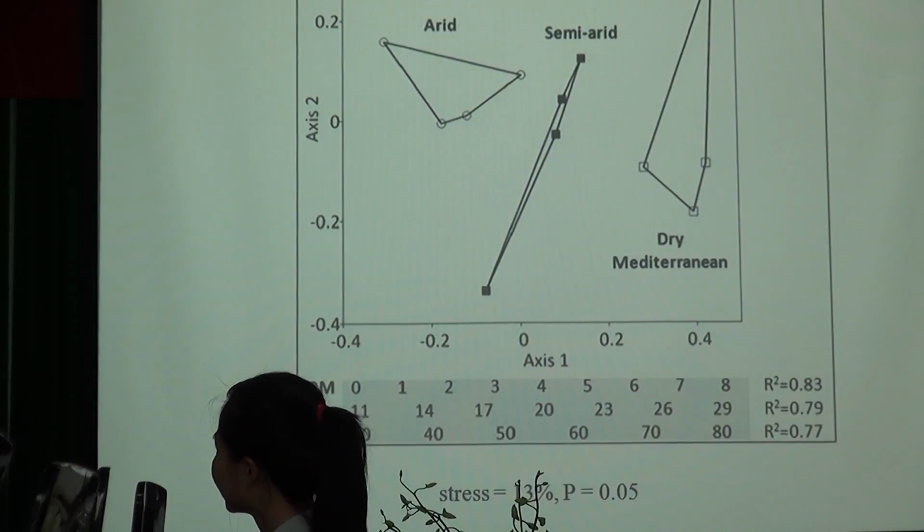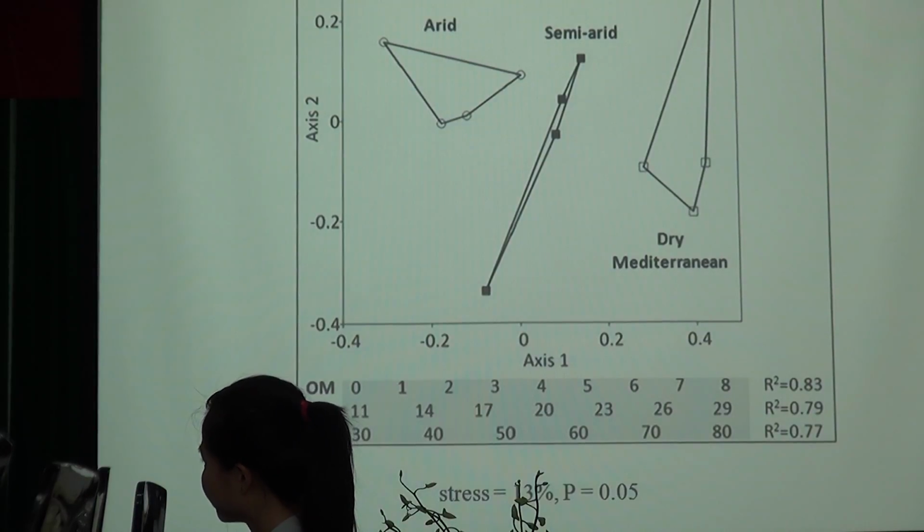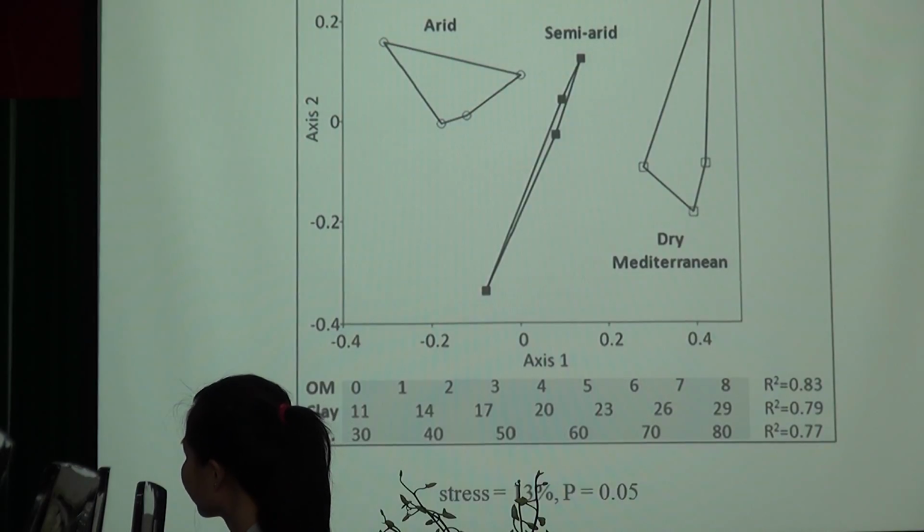It means that the profiling that we get, the peaks that we get, are different enough that we can say that they originate from 3 different places.